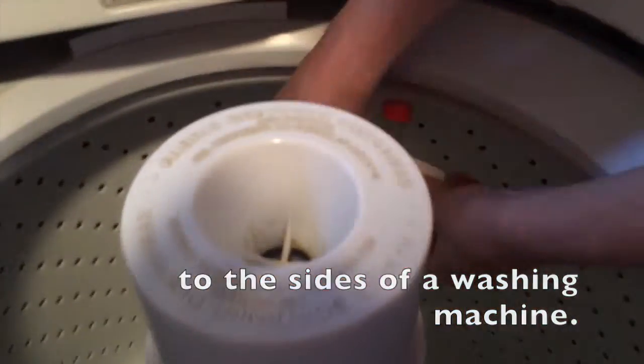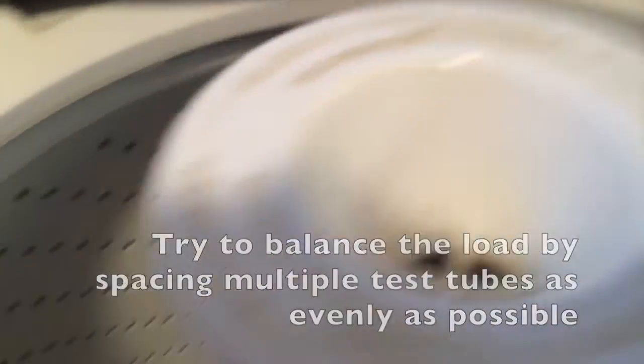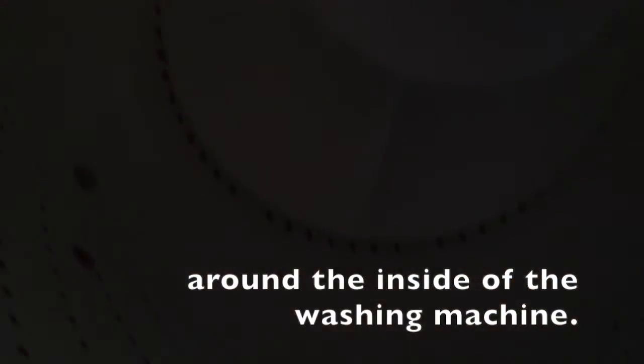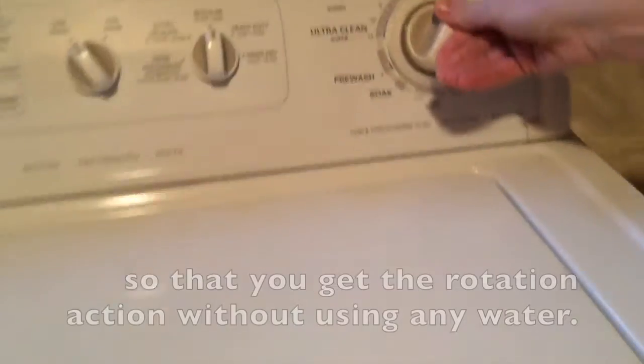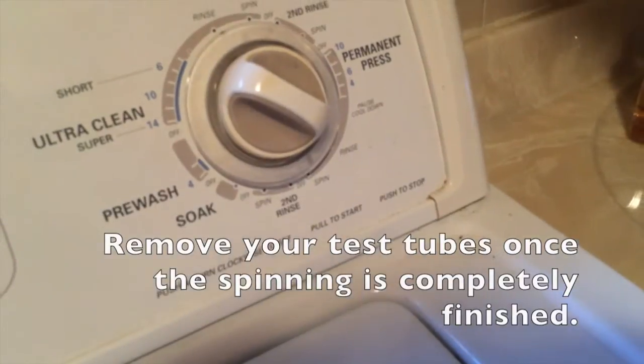Try to balance the load by spacing multiple test tubes as evenly as possible around the inside of the washing machine. Close the lid and set the washer to the spin cycle so that you get the rotation action without using any water. Remove your test tubes once the spinning is completely finished.